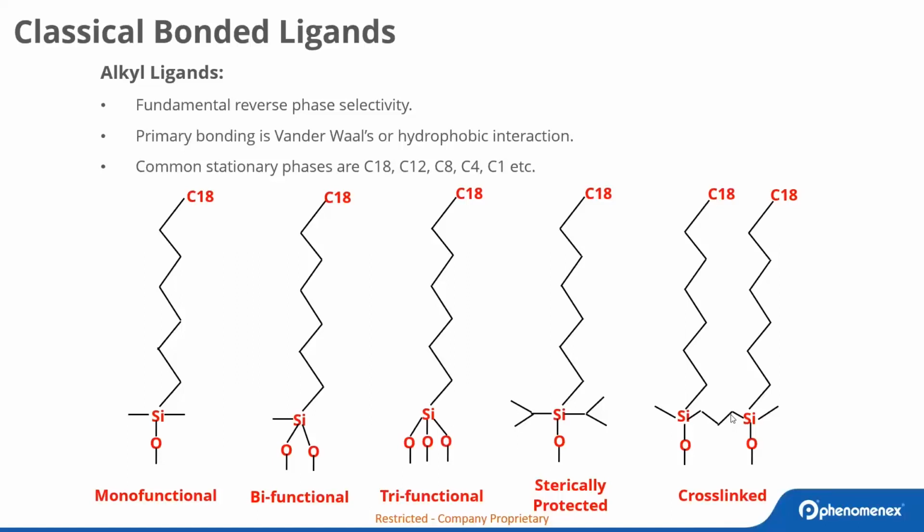This bridging or cross-linking technology can be extended from one to several protective organic and inorganic layers, right? So depending on that, it would result in different stability of the phase. However, this cross-linking should not be confused with a full hybrid silica particle, where the organic moiety is the main component of the particle construction and not just on the surface of the particle.